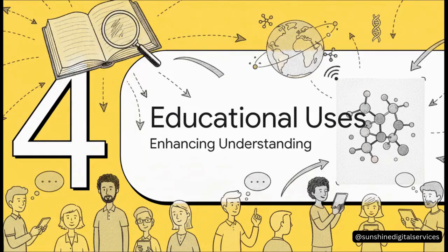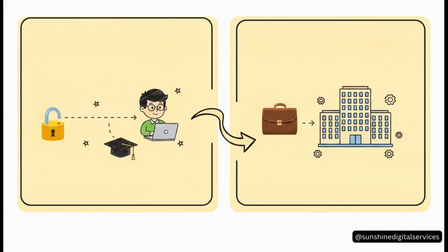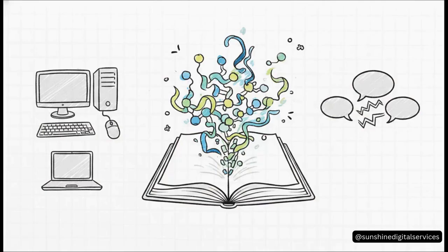Finally, we arrive at Section 4, Education and Accessibility, opening the lens to everyone. Shifting gears from high-level lab research, let's look at how this tool democratizes science. We have open-source PyMOL, which is completely free to use and highly accessible for students and global researchers. On the flip side, you have PyMOL by Schrödinger, a proprietary version offering additional features and paid support. So the crucial point here is that PyMOL scales perfectly to your exact needs and budget. It bridges the gap from a free, vital educational resource all the way up to a high-end enterprise tool driving multi-billion-dollar R&D pipelines. And it sits inside this massive visualization ecosystem.